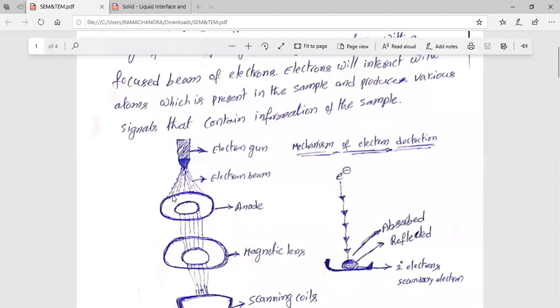The electrons fall on the surface of the anode in different directions. These directions are restricted by this closed surface, which restricts the various directions of electrons moving from the electron gun to the anode.